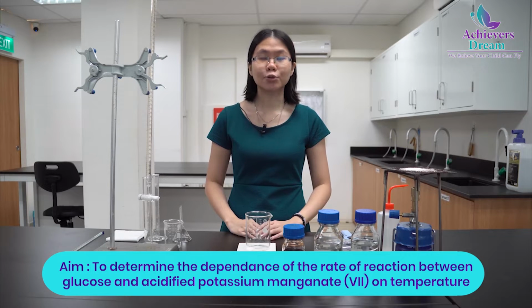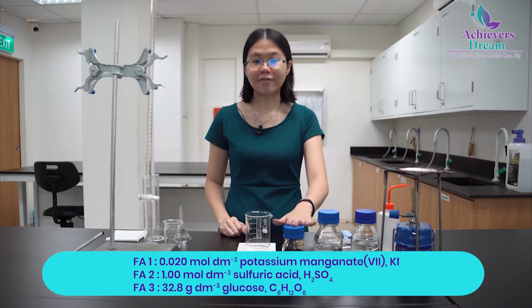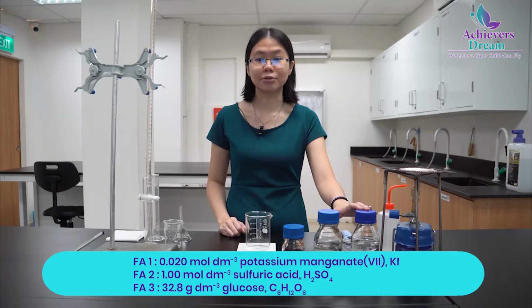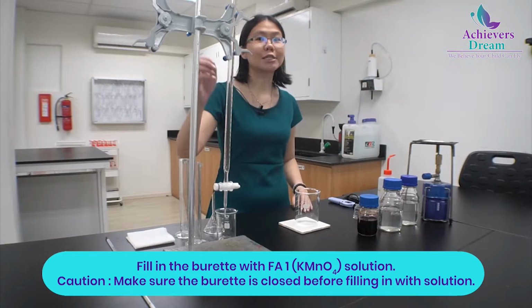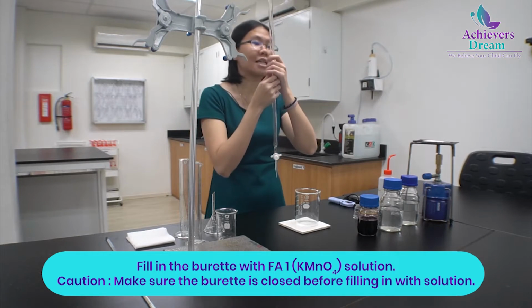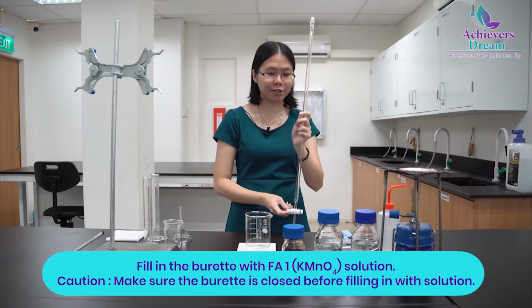You will be provided with 3 solutions. The first one, Fa1, is potassium manganate 7, Fa2 is sulfuric acid, and Fa3 is glucose solution. So your first step is to fill up your burette with potassium manganate 7, which is Fa1 solution.